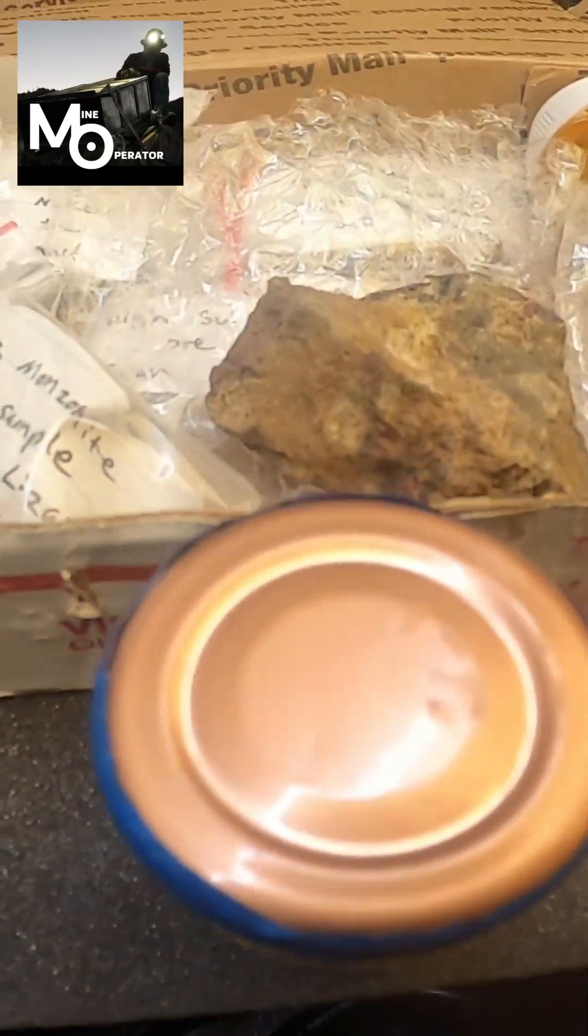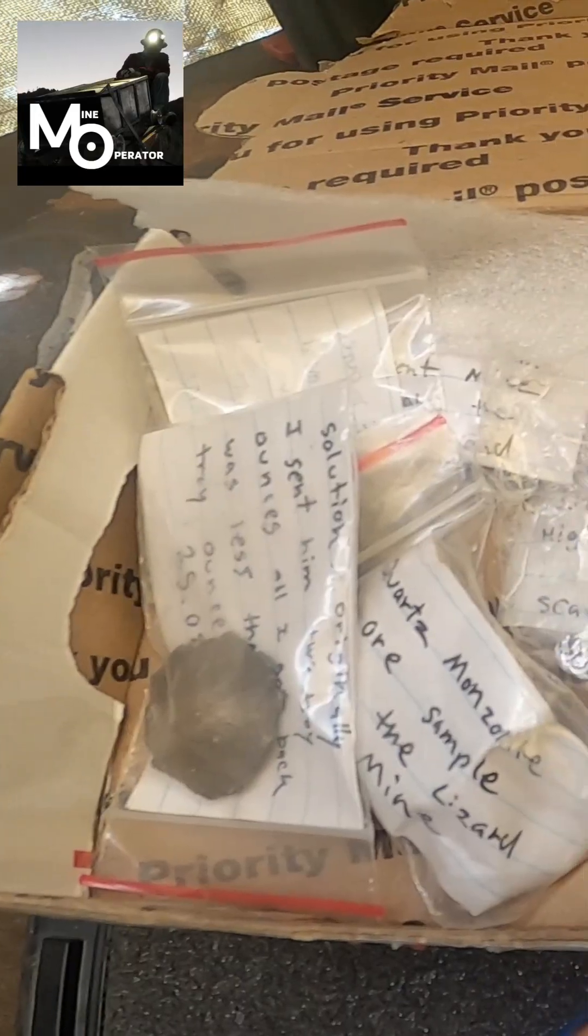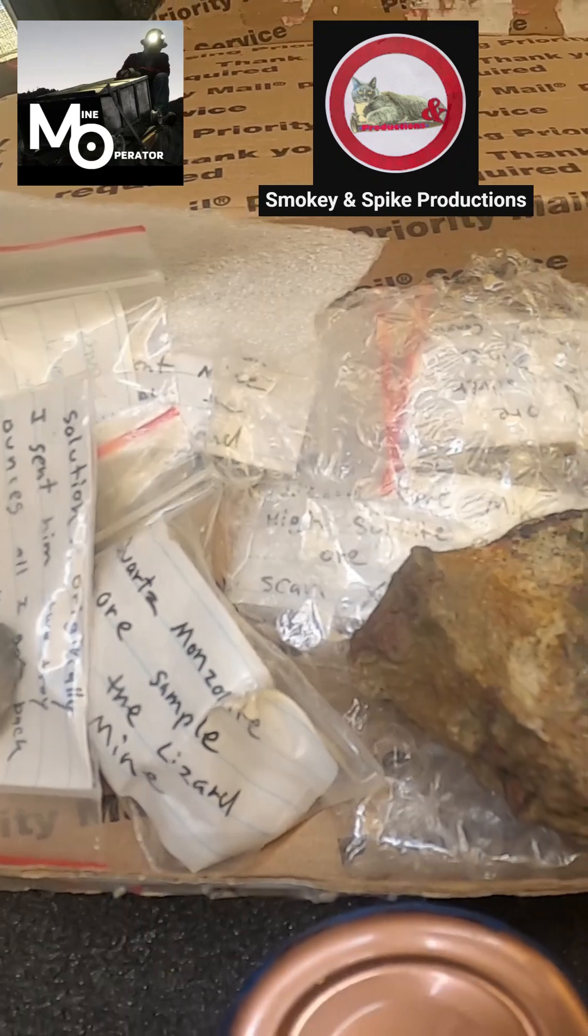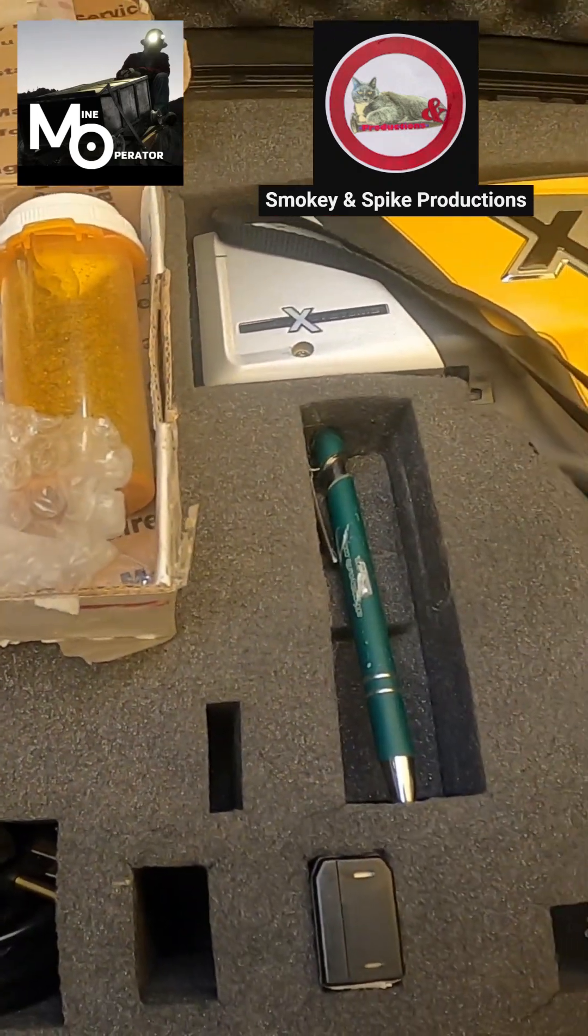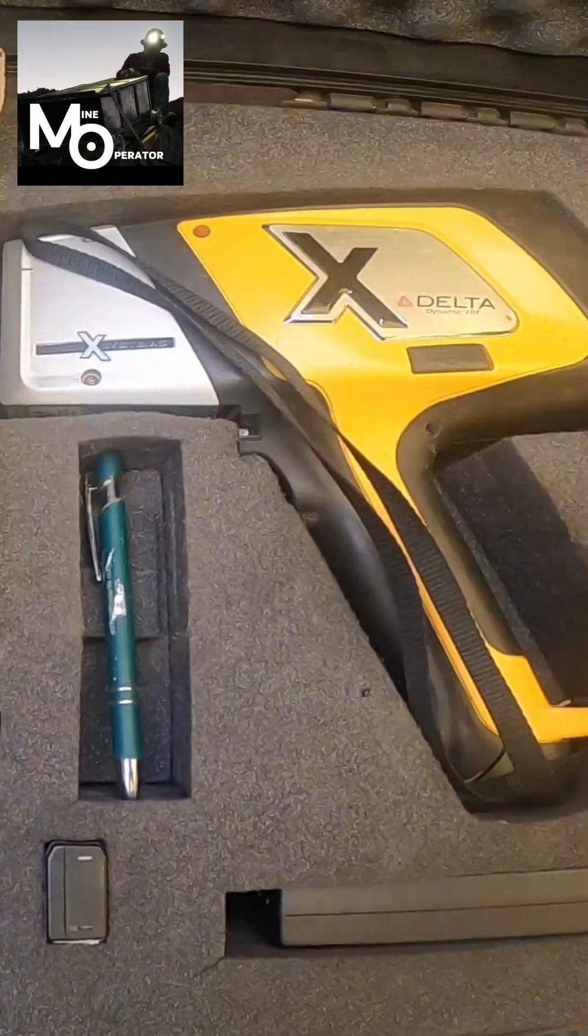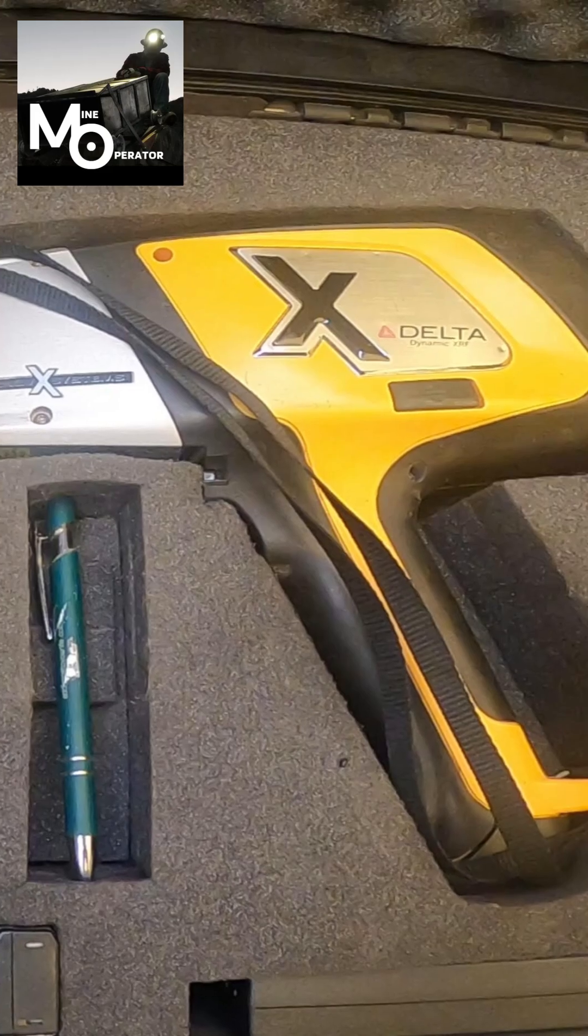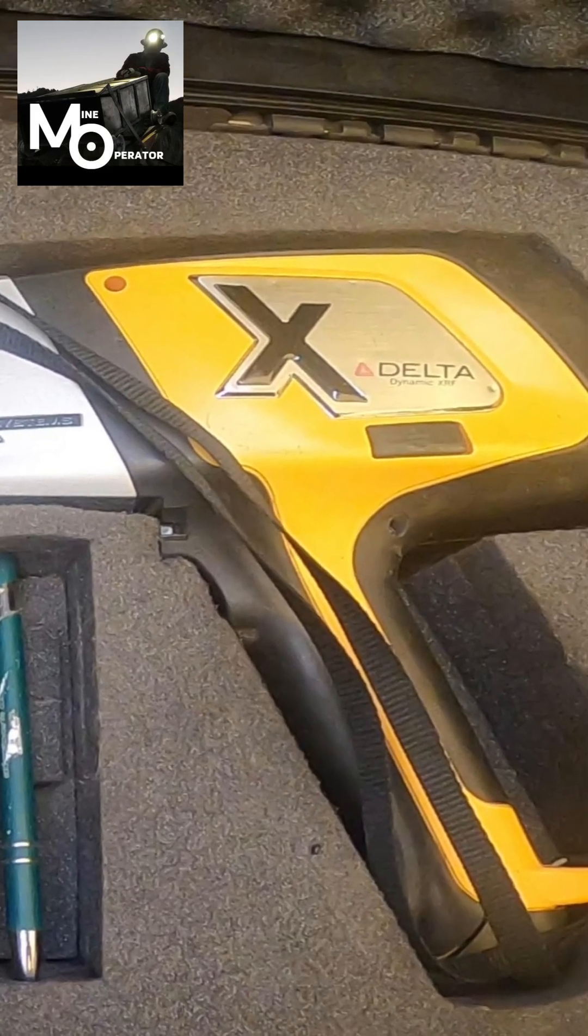Today we are going to use our XRF to analyze samples that Sean from Smokey and Spike Productions had sent me. We will be using our Delta DP6550 50kV unit to test these samples.